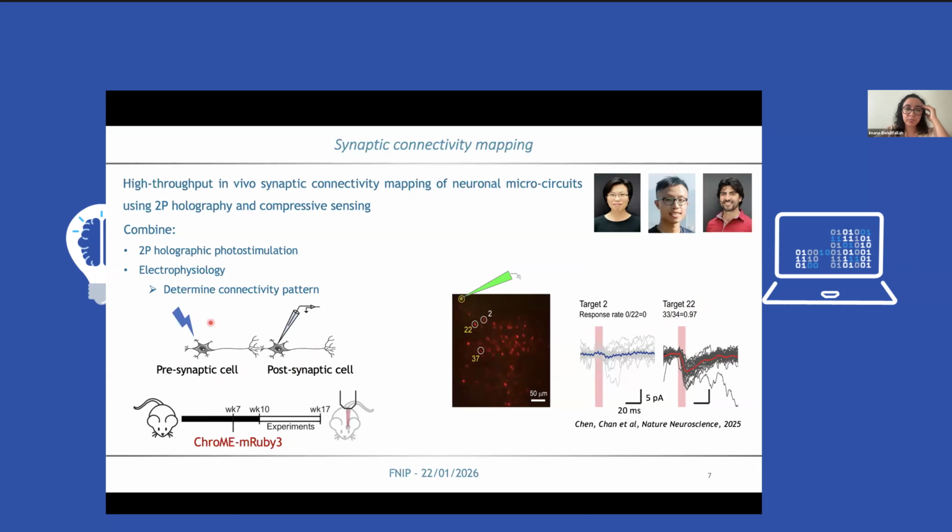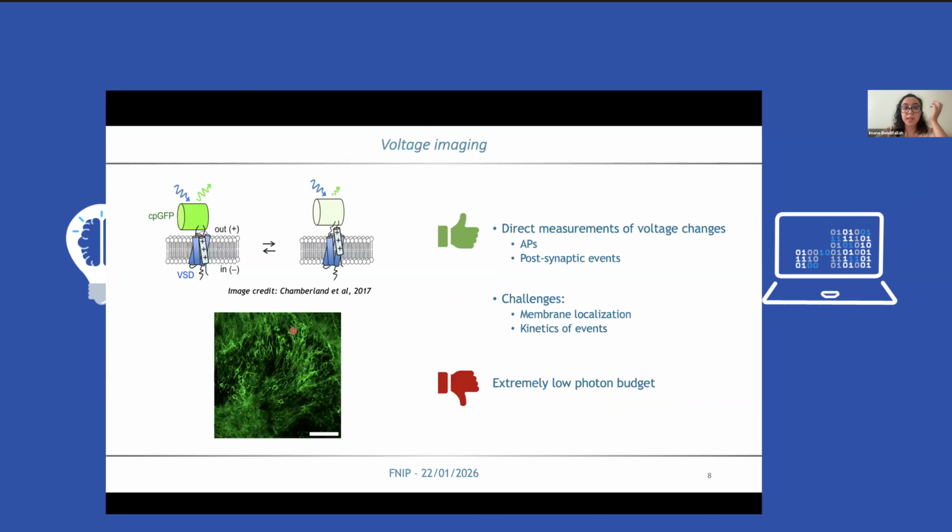study a step further. So first, by making sure that we are indeed always activating the cells that we are photostimulating, so that we can dissociate the false negatives from the true negatives. And also another thing that we want to do is to remove this electrode here and replace it with light as well. In both cases, one way to do this would be to use voltage imaging, so to use voltage indicators.